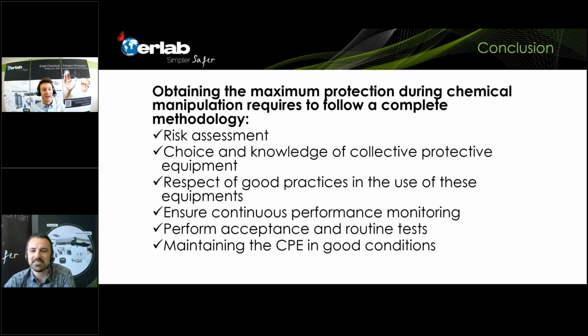The answer is no, in the sense that of course you can use filters inside the biosafety cabinet, but the biosafety cabinet is used to protect the sample and the user, and it works in a completely different way. However, you can have filters, but it's mostly also extracted to the outside air.